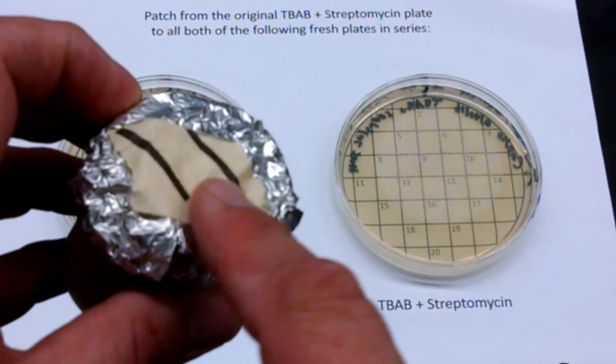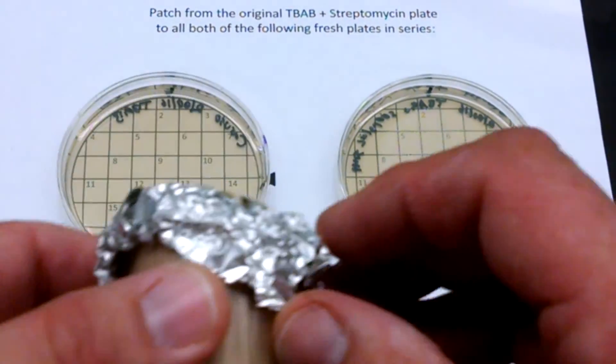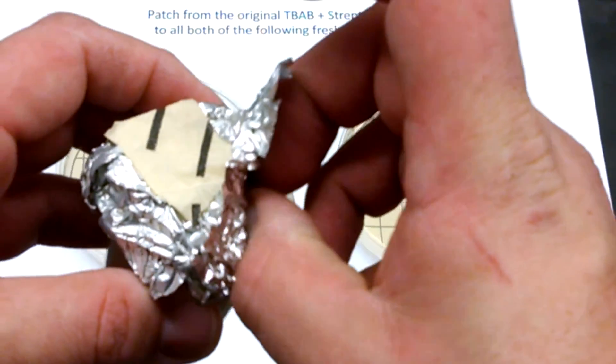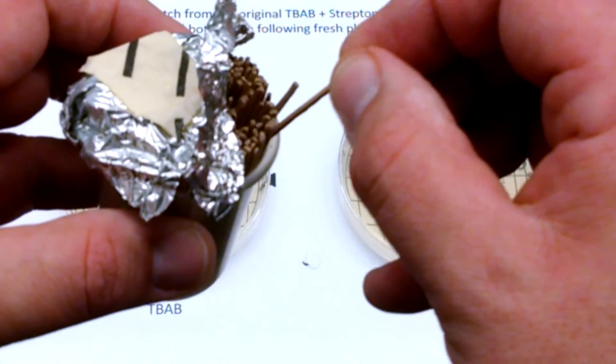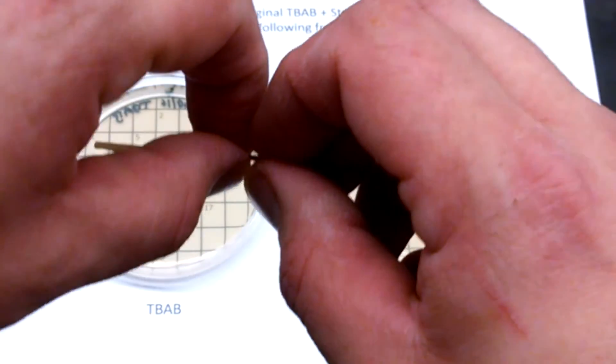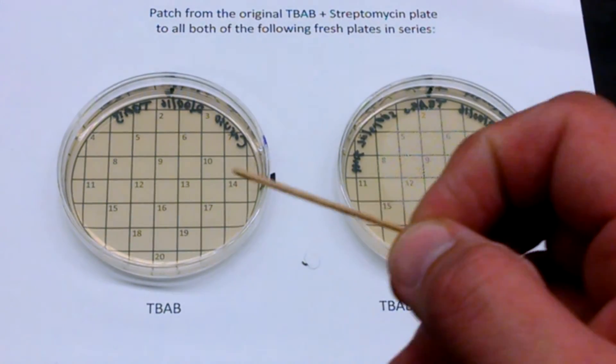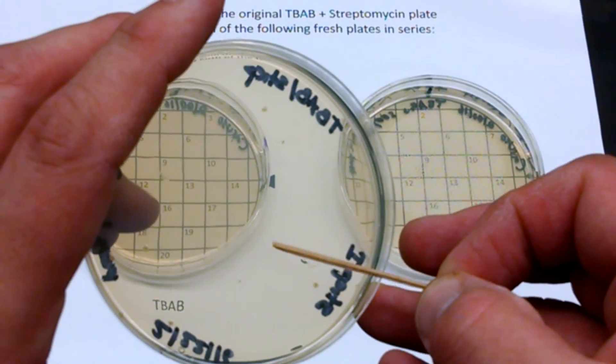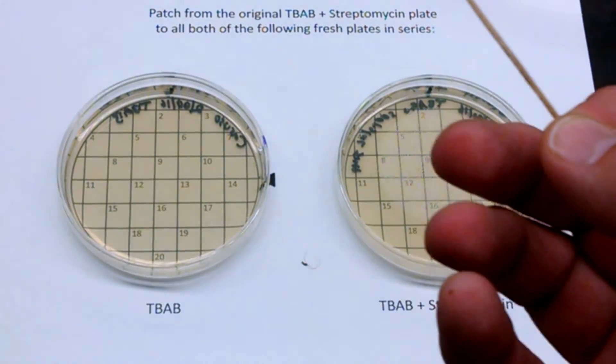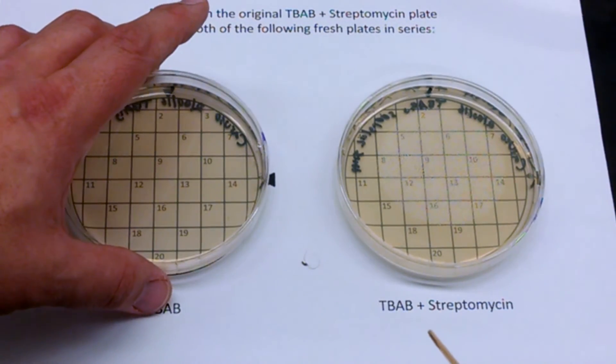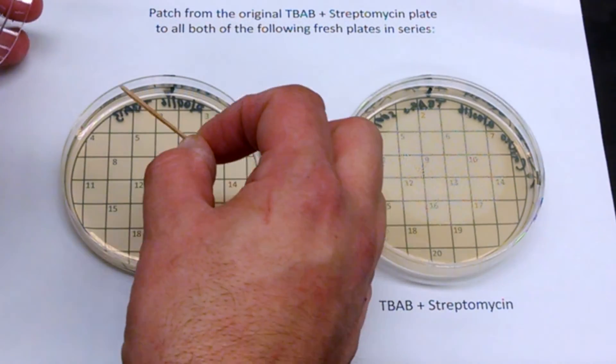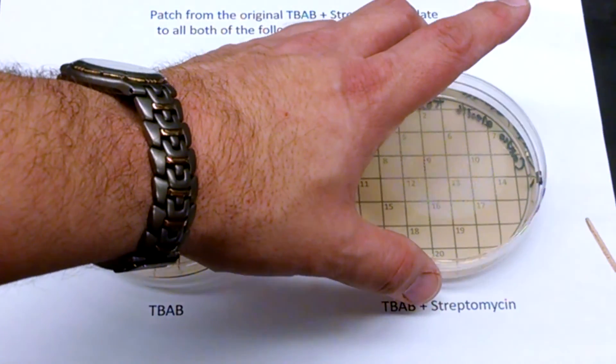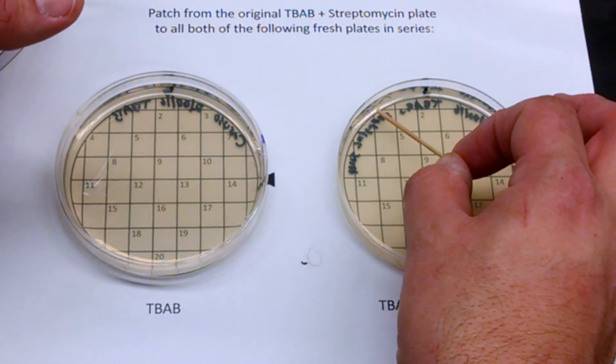So we have these sterile toothpicks. You can tell by the tape that has the black lines on them. We'll use the end that's down at the bottom that we haven't touched. And we're just going to touch a colony. Just touch. You don't have to gouge it. You don't have to smash it or anything. Just touch it. And then open the lid. And then we're just going to draw a little line.